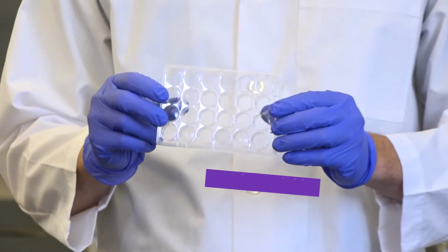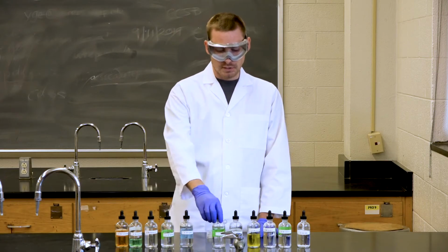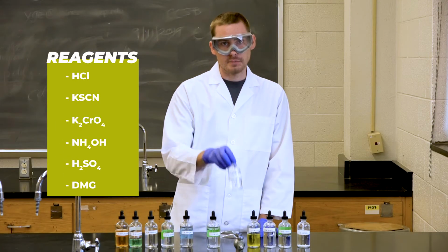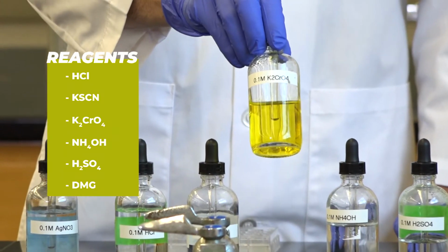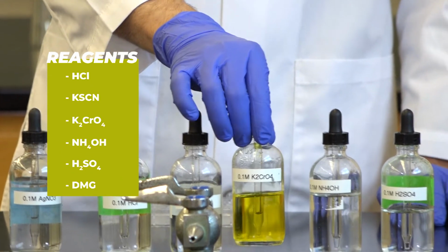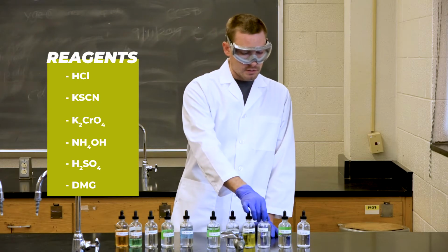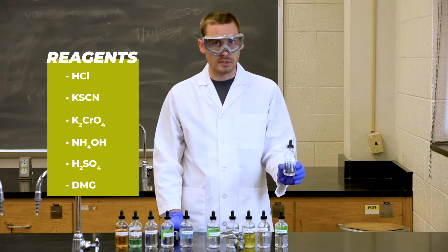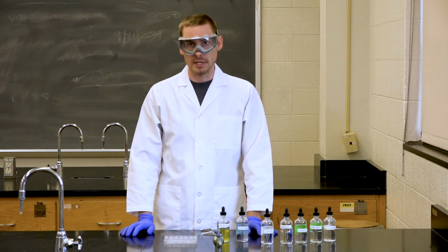You will need a well plate for the spot test, and then you will need 6 reagents. The first one being 0.1 molar hydrochloric acid, the second being 1% potassium thiocyanate. The next is 0.1 molar potassium chromate, 0.1 molar ammonium hydroxide, 0.1 molar sulfuric acid, and finally 0.1 molar dimethylglyoxime. So our first example is using silver nitrate and potassium chromate.